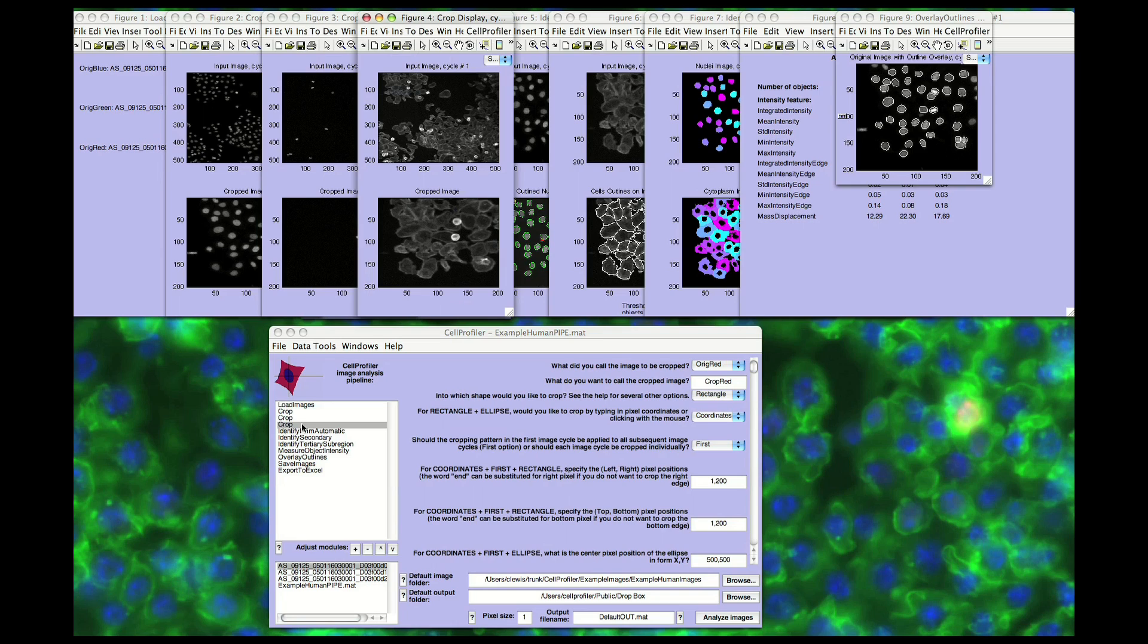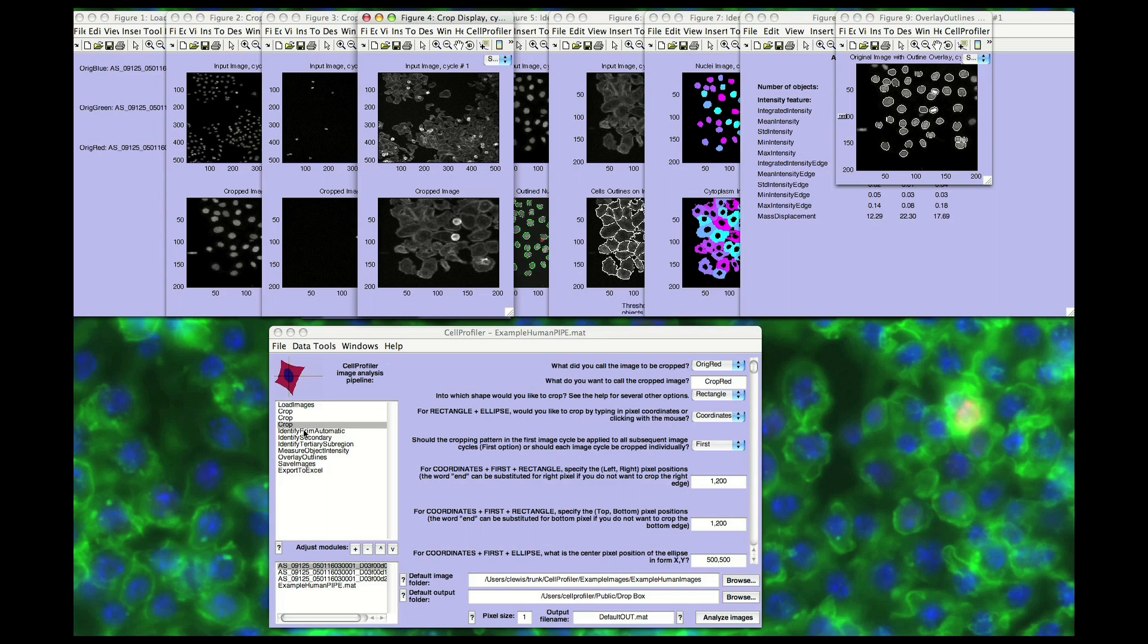In most biological images, cells touch each other, causing the simple, fast algorithms used in some commercial software packages to fail. The next several modules deal with object identification, which is the most challenging step in image analysis, and its accuracy determines the accuracy of the resulting cell measurements.